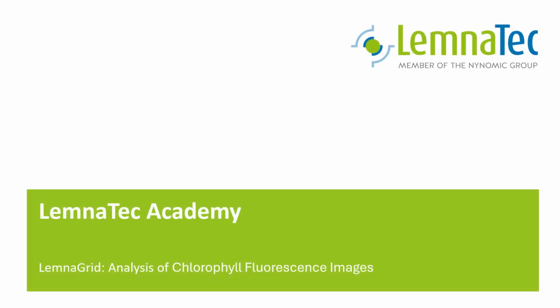In this video, I will explain the chlorophyll fluorescence analysis using LemnaTec systems and LemnaGrid. We use a variety of different sensors for chlorophyll fluorescence from different vendors in our systems. The decision which sensor is used is made when the system is designed. It depends on factors like plant size, field of view, etc.